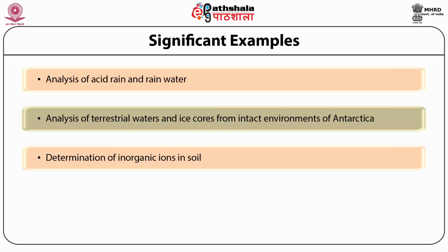The potentiality of IEC to quantify various stable metal complexes and metal oxidation states in soil extracts is beneficial in determination of the toxicity, fate, and transport of metals in soil. Determination of phosphorus, sulfur, nitrogen, and their analogous oxide anions, for example, phosphate, sulfate, and nitrate, is emphasized in soil fertility and its conditioning.